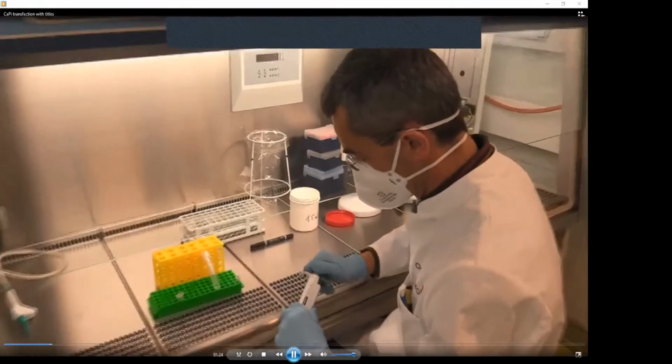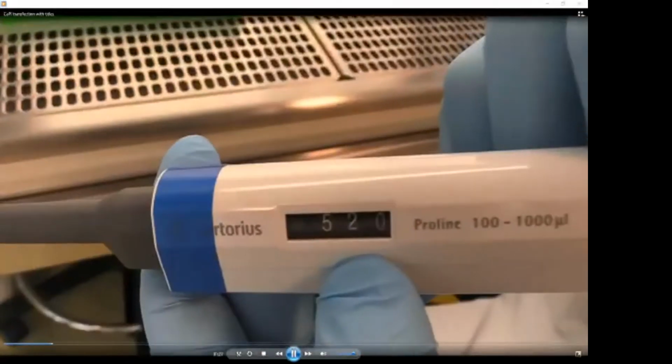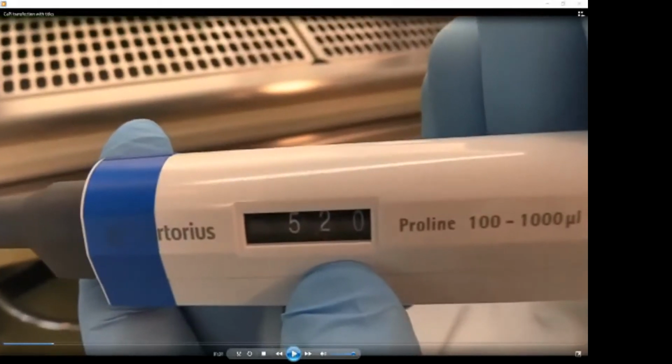Now, the first step of the protocol, which I have provided you with before, is that you have to prepare one tube with the HEPES buffered saline, 520 microliters. Why this volume? Because our experiment contains 4 different samples, and these 4 different samples are always done in triplicates.